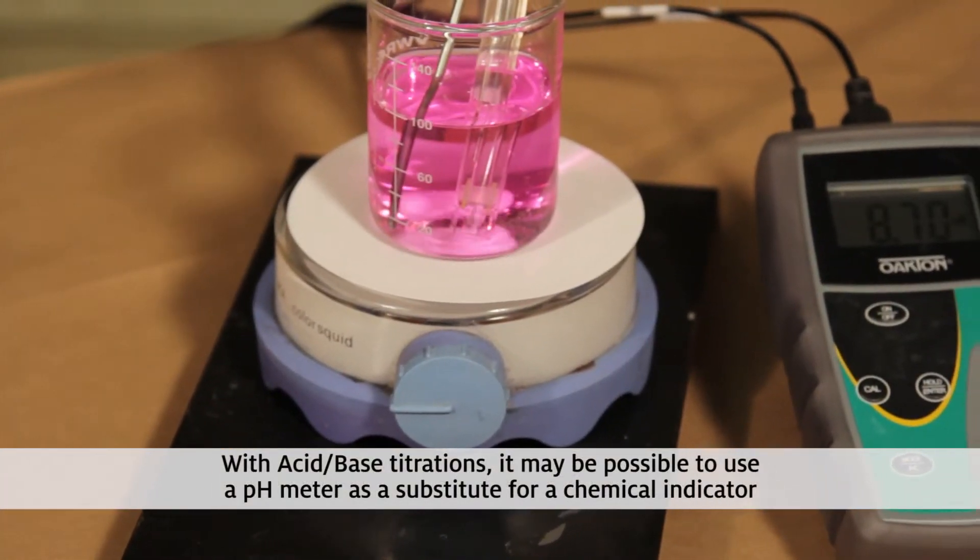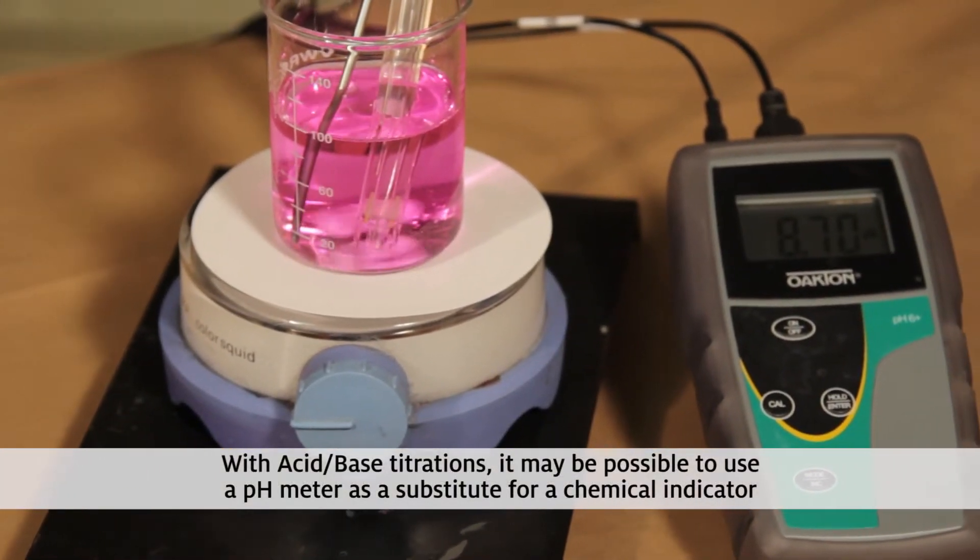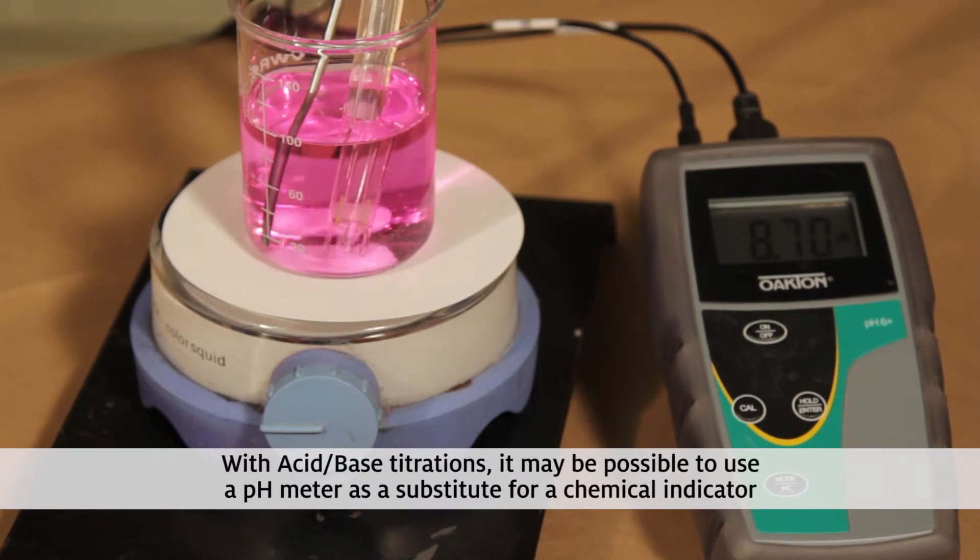In some cases, such as acid-base titrations, it may be possible to use a pH meter as a substitute for a chemical indicator.